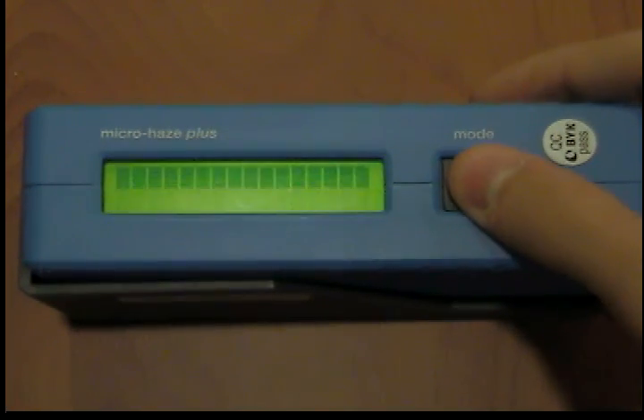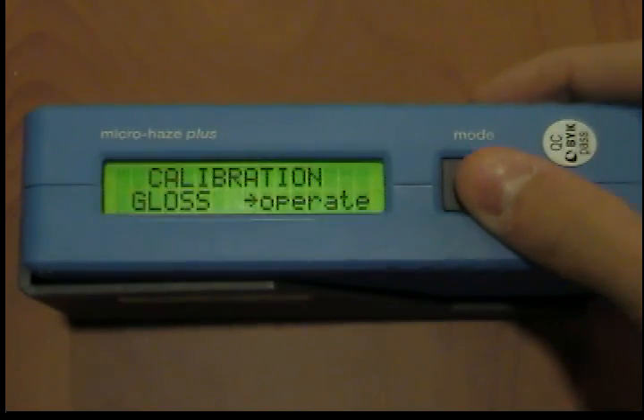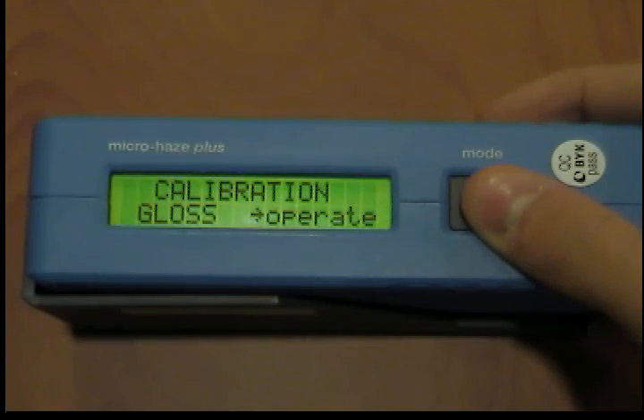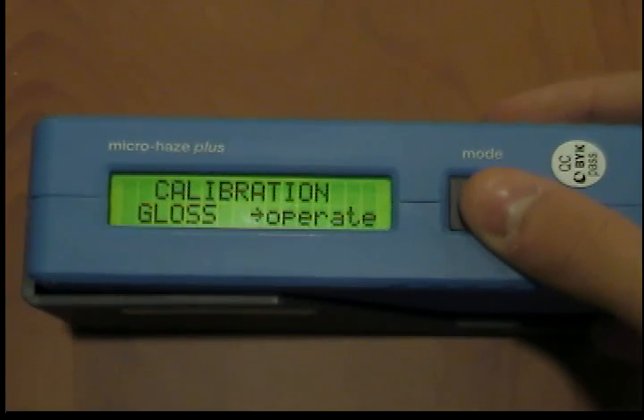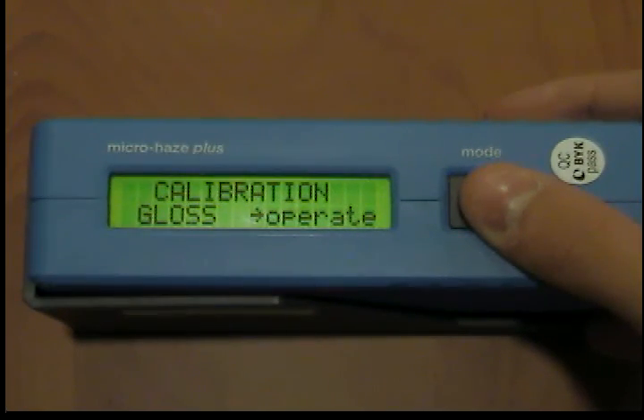Changing calibration values. The values of the supplied calibration standards are stored in the measurement unit. When automatically calibrating, this data is allocated to the respective standard in the holder. In some cases, it may become necessary to enter the data for a new calibration standard — for example, if the standard used so far is damaged or scratched. Only use original standards of the manufacturer to ensure exact calibration.